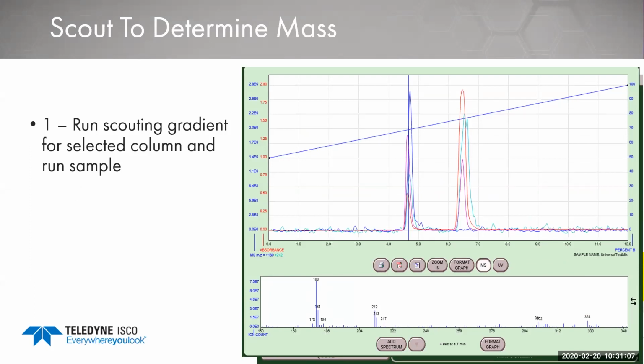I'll get to that. I'll go through them one at a time. What is the cause of the fluid interface pressure? Excellent question, Nancy. Nancy is someone who likes to check me all the time, and I appreciate it. So yes, one of the things that we would see is if we have a high pressure, obviously I mentioned low pressure or no flow.